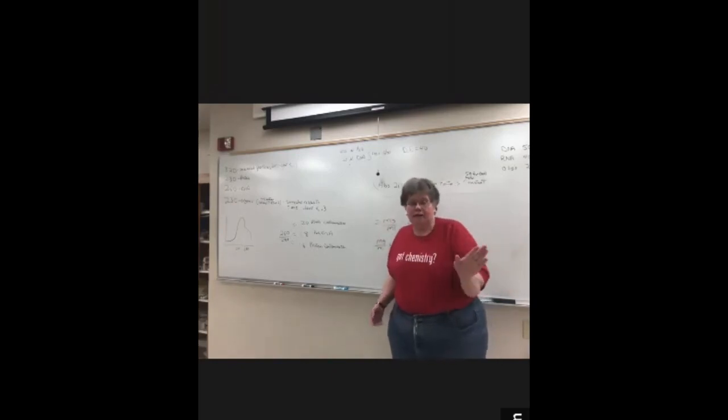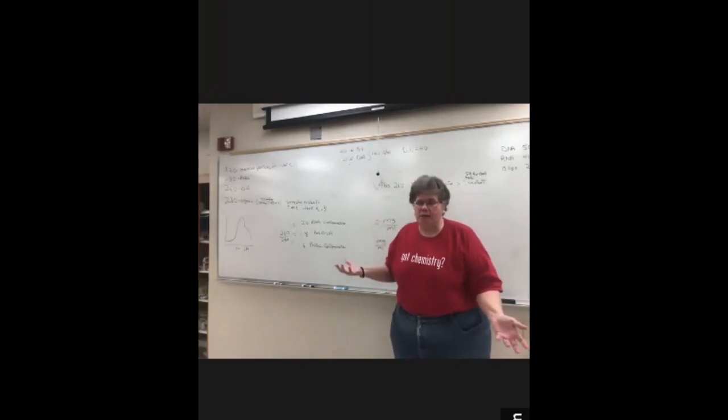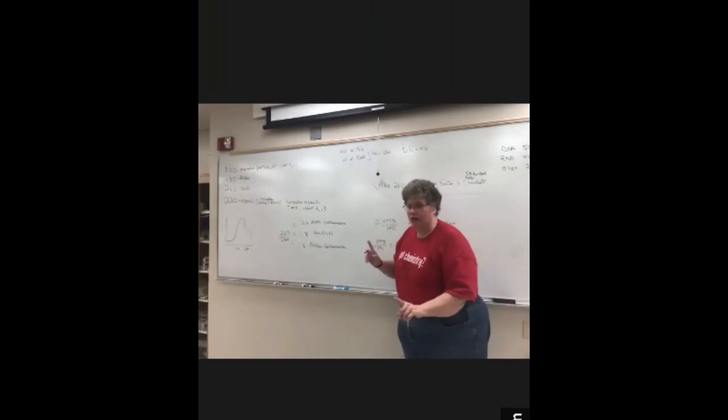Now, not everybody at this point has to bring up their DNA in 1 mL of buffer. When I was working in a lab, our preferred dilution, we would bring it up in 0.5 mL of buffer. So as long as you know the volume that you're bringing it up in, you're fine for the next step.